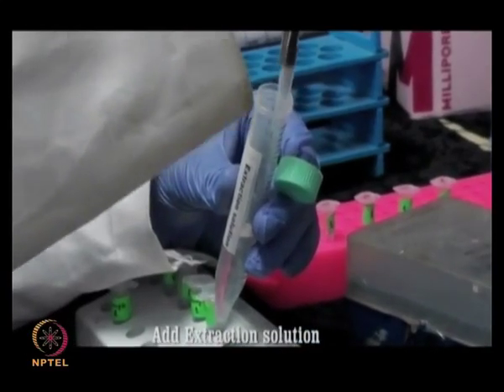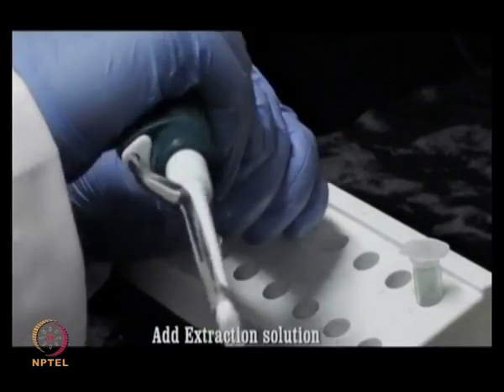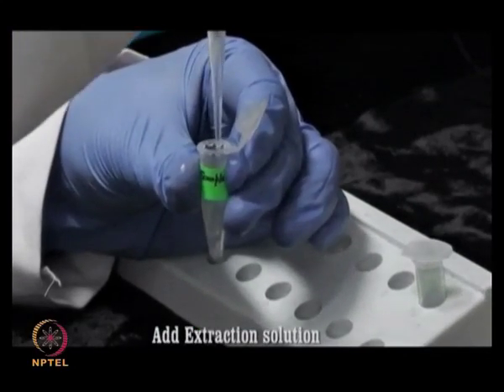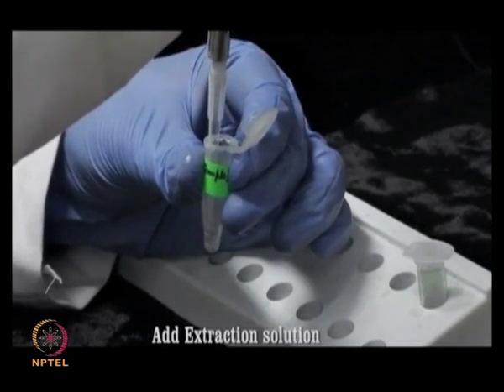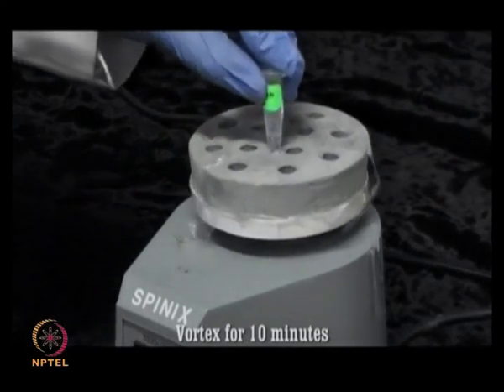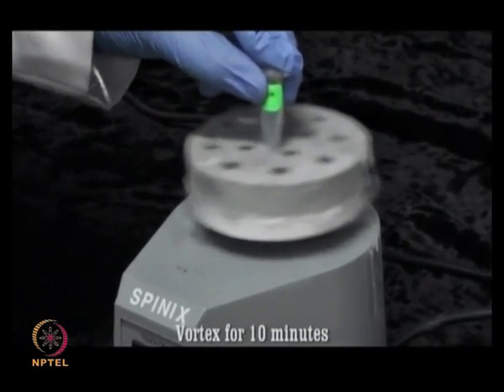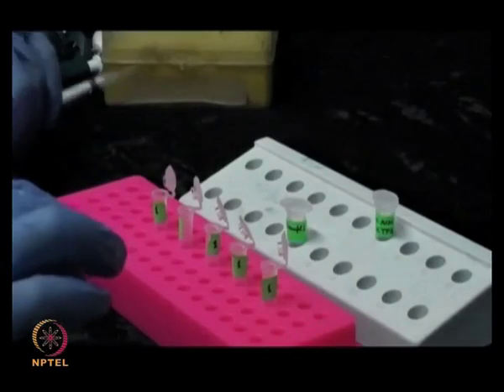Now, after the overnight incubation, the peptides generated through the proteolytic digestion can be extracted by using extraction buffer containing 0.1% formic acid or trifluoroacetic acid in 50% acetonitrile solution.